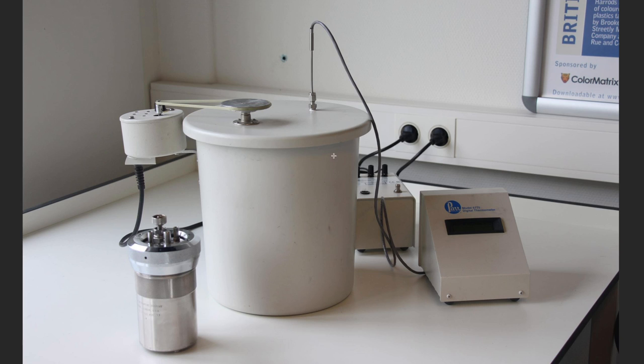This whole thing is in an insulated vessel, so it's meant to be as adiabatic as possible.